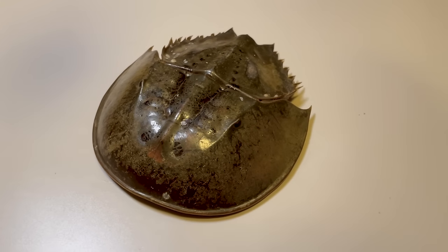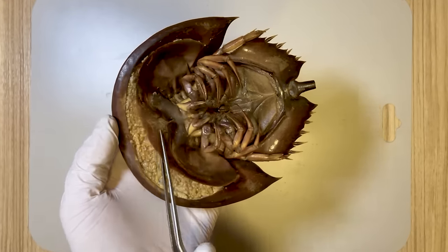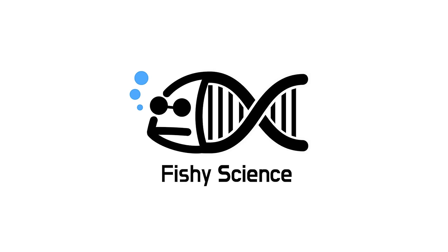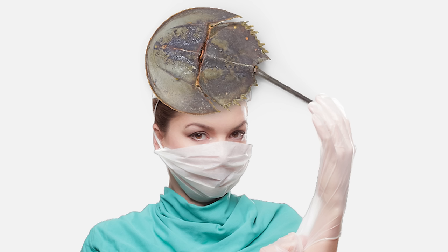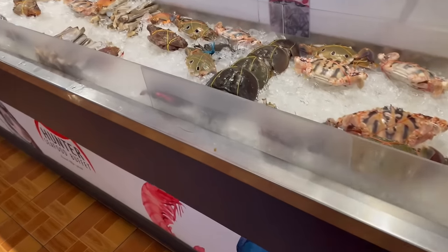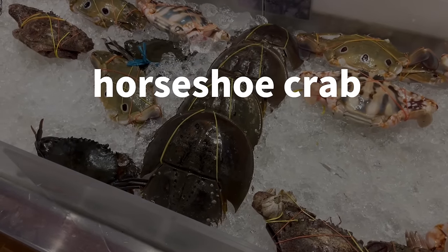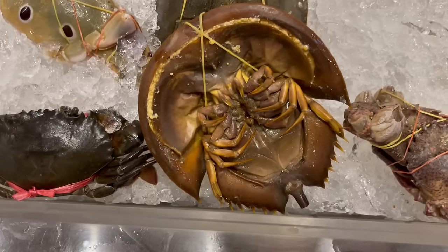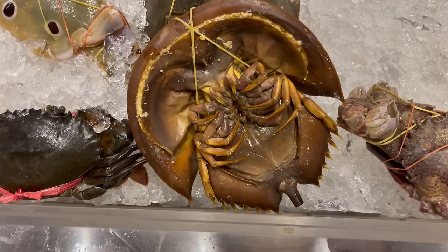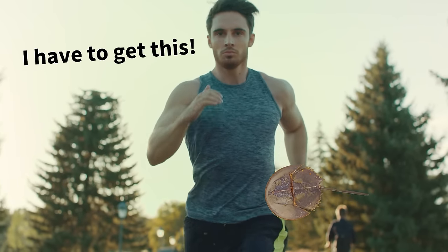This is a horseshoe crab, often referred to as a living fossil. If you peer inside this horseshoe crab, you'll discover some genuinely peculiar features. Today, let's delve into the dissection of a horseshoe crab. During a business trip to Thailand, I stumbled upon a seafood store and encountered a specimen I'm eager to share with you. It happened to be this exact horseshoe crab. Regrettably, the tail had been severed, but it provided an excellent opportunity to examine the distinctive traits of the horseshoe crab, so I promptly purchased it and took it back to my hotel.